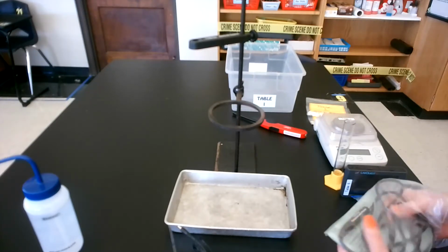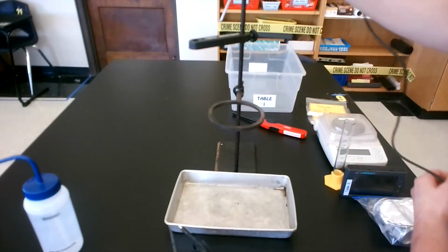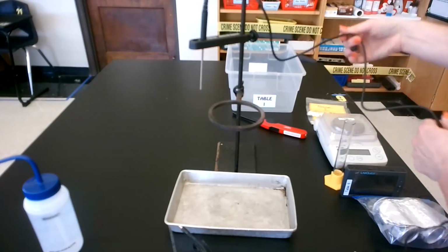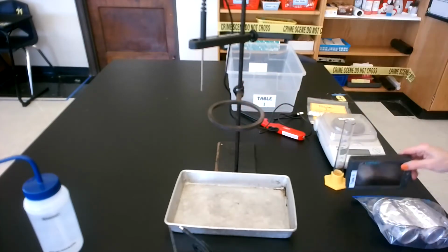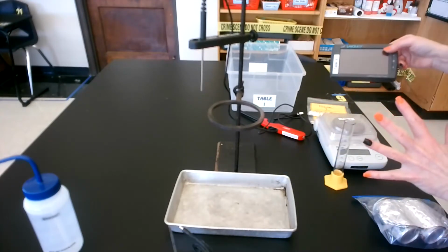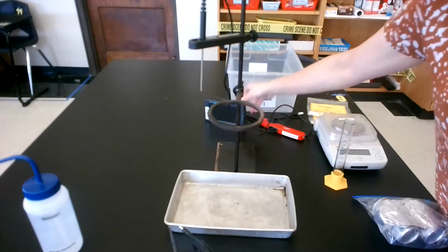When we hook up the temperature probe, there's 2 holes. So it's not sliding through, put it in the smaller hole. And since we're working with an open flame, we're going to tuck this wire behind, and then someone's going to be in charge of monitoring the LabQuest and watching the temperature, making sure it doesn't stop. And also we need to determine when it reaches the highest temperature, because then it will start to cool down.